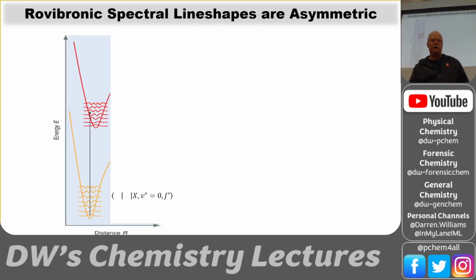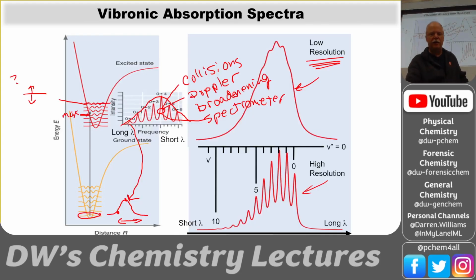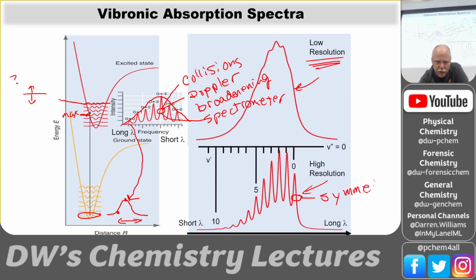Okay, now let's talk about the line shape. These individual peaks here are very symmetric. So this peak right here, individual transitions may be very symmetric. But when you have all of those peaks with varying intensity summed up underneath a larger peak, then you can get asymmetric peaks.